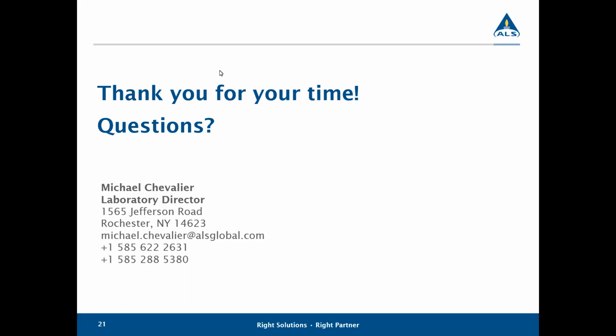Raphael would like to know, is the monitoring well purged before deploying the passive diffusion sampler? No, the passive diffusion sampler can just be deployed as is.